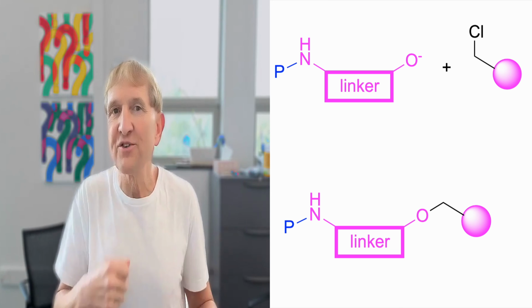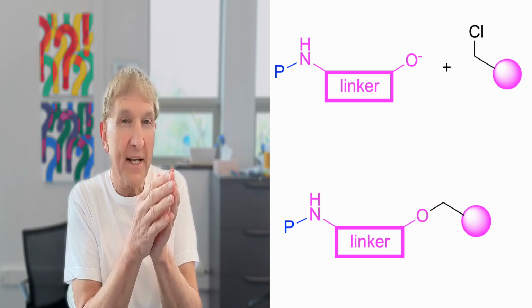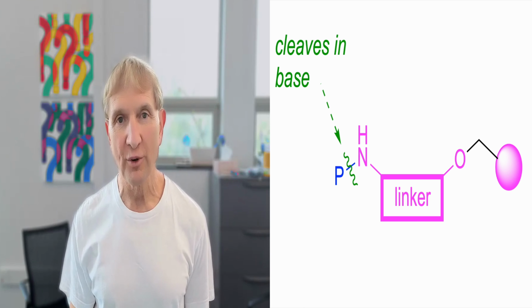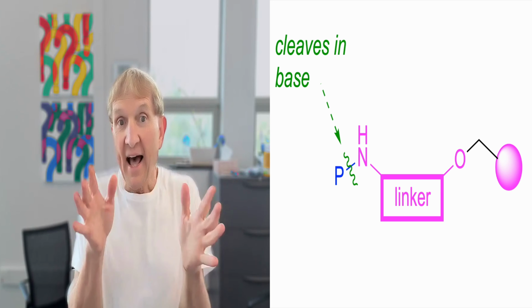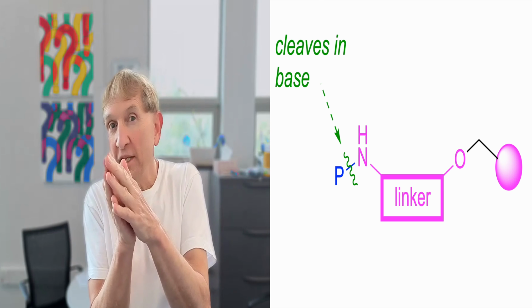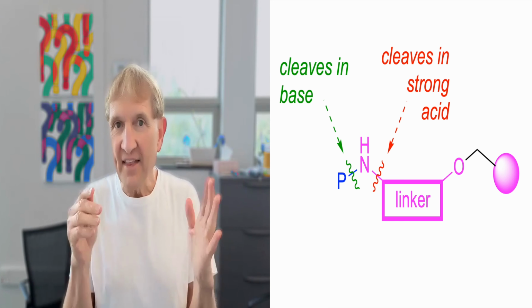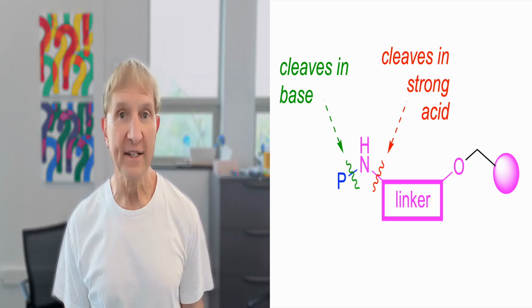A key characteristic of the linker is that the nitrogen protecting group is easily cleaved by base in the approach that we're following right now, and that's the FMOC approach, it's called. But at the end of the synthesis, the nitrogen will be cleaved from the linker, carrying everything that we've added to the nitrogen with it. The linker then has got orthogonal chemoreactivity.